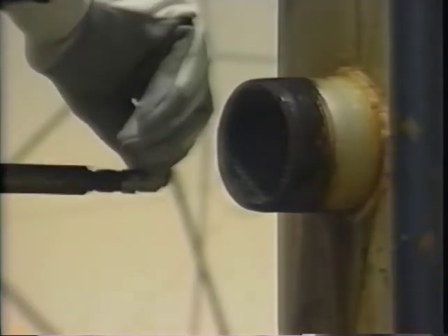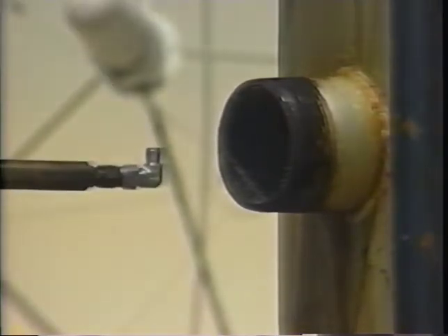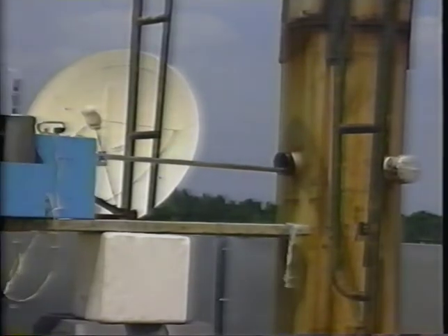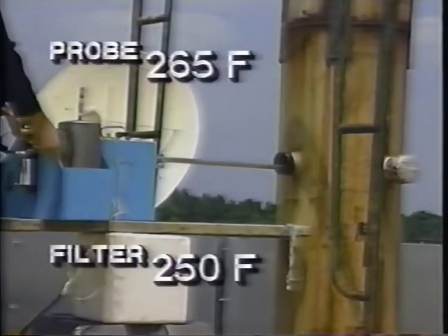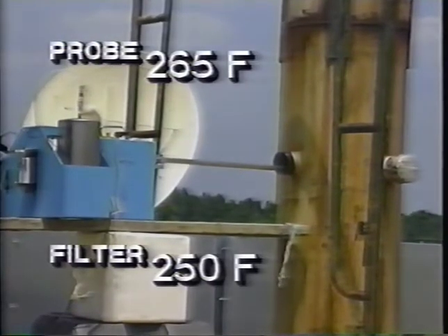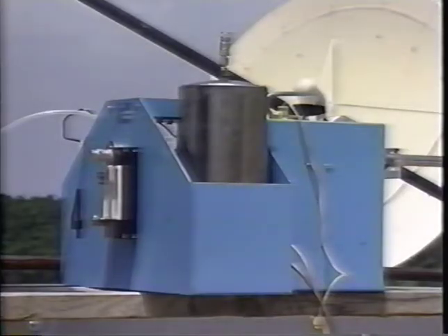The sampling probe with a 90-degree nozzle is positioned in the stack such that the probe is perpendicular to the stack axis and the nozzle opening faces away from the direction of gas flow. The probe is heated to 265 degrees Fahrenheit and the filter to 250 degrees Fahrenheit, and the sample is collected. After collection, the sample tank is taken to a laboratory for recovery and analysis.